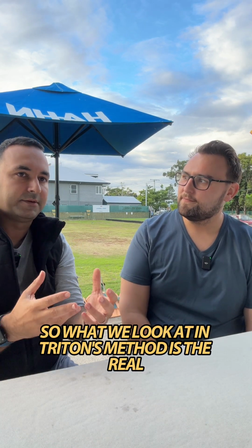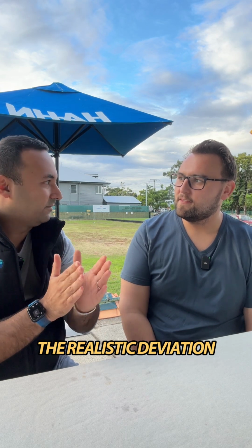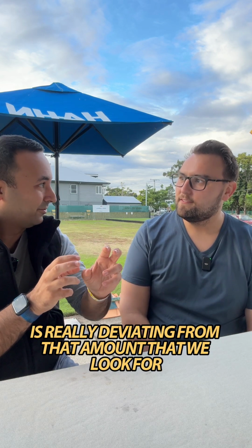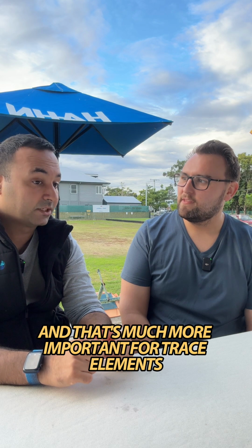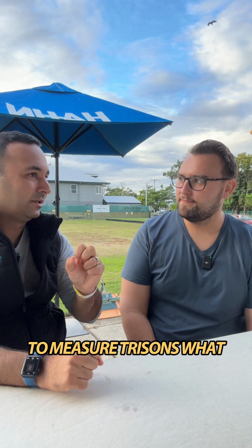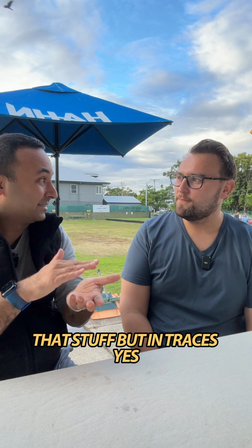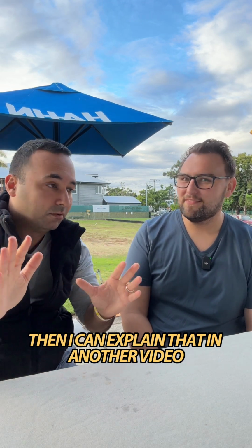So what we look at in Triton's method is the realistic deviation, the real milligram per liter that is really deviating from the amount we look for. That's much more important for trace elements. That's really good because an ICP is made to measure trace elements. It's not really made for magnesium and that stuff, but in traces, yes, not in high amounts. I can explain that in another video if you want.